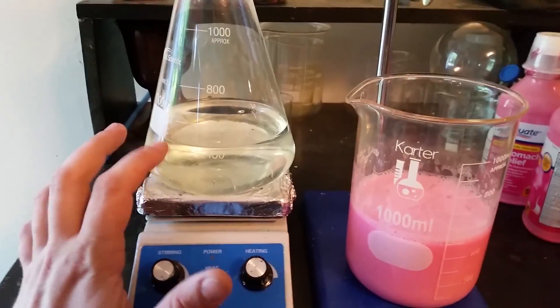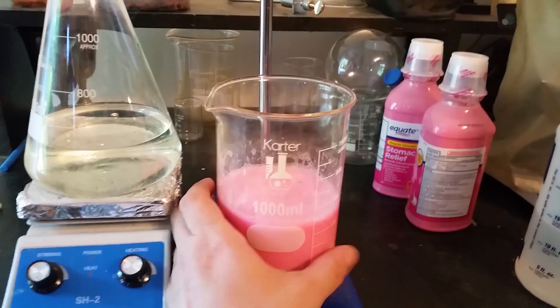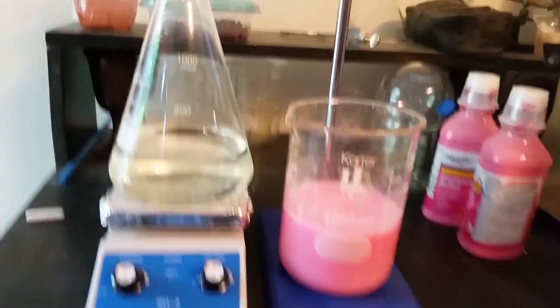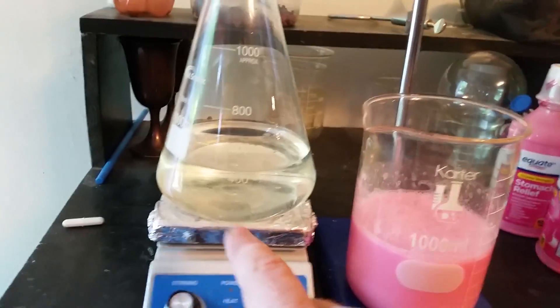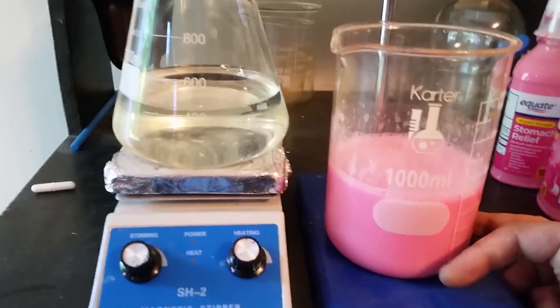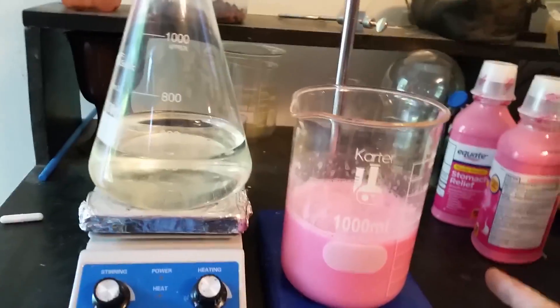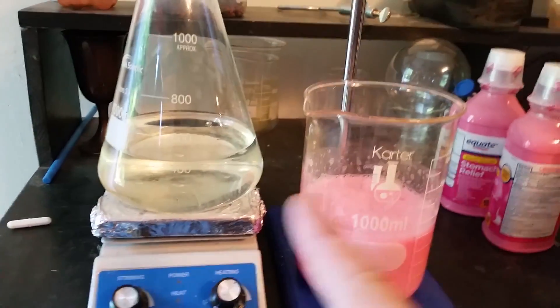I've got the hydrochloric acid added to the Erlenmeyer flask and I've got a funnel sitting up top here. I went ahead and emptied out the partial bottles into the flask of Pepto-Bismol. One of the big differences between this reaction and what Nile Red had done was he was using the pills, the tablets, instead of the liquid form. He also used significantly more water in his reaction than I am, because this stuff is already liquid — it's already dissolved into purified water. I was also using a spray bottle to rinse out the bottles, so there's a decent amount of water already in here. I'm going to drop in a stir bar, get that stirring, and then start adding the Pepto-Bismol.